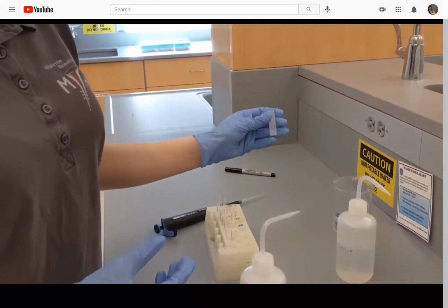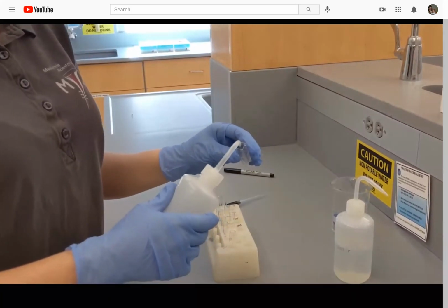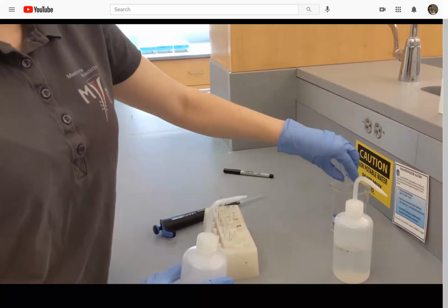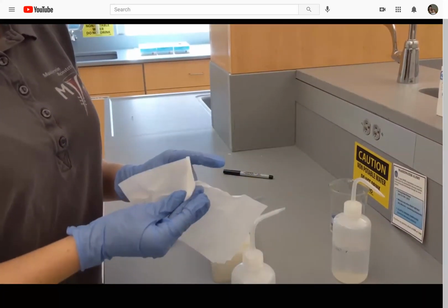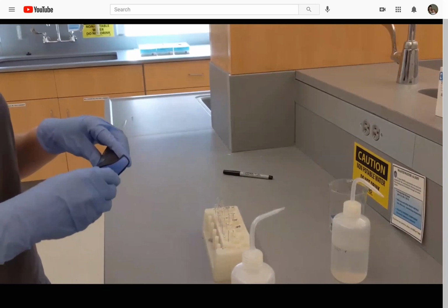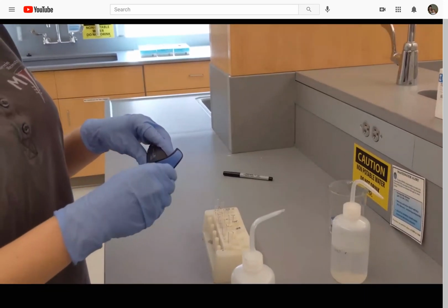All right, so before I do my next solution, I'm going to dispose of my liquid in the waste beaker. I'm going to rinse out my cuvette with DI water to make sure there's no residual solution in here. And I'm now going to add my next solution after I increase the amount of liquid that my pipette's going to draw up.